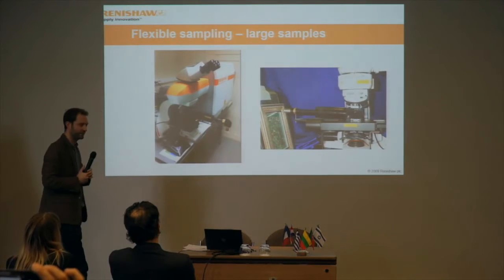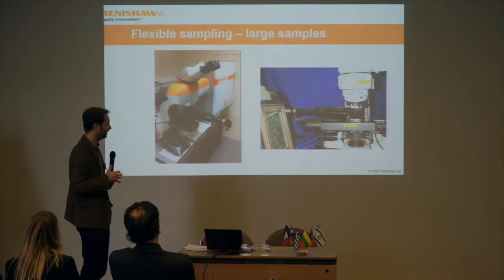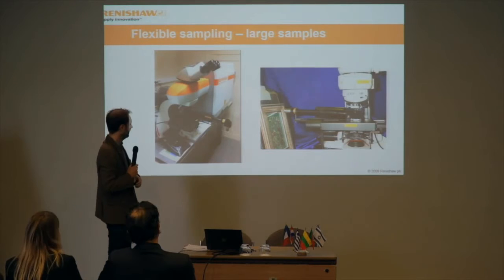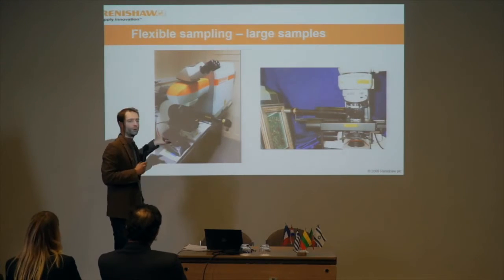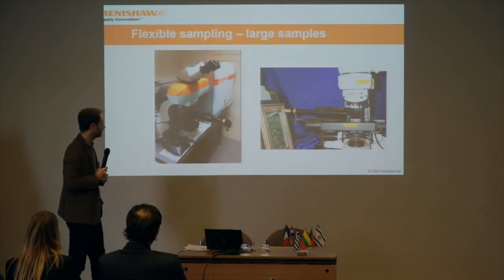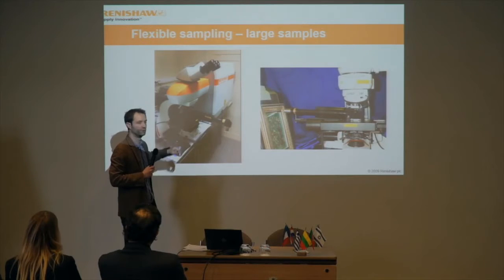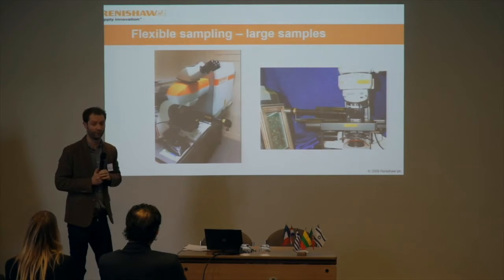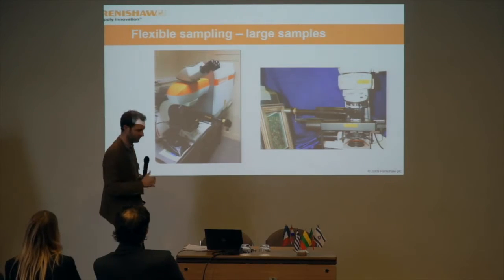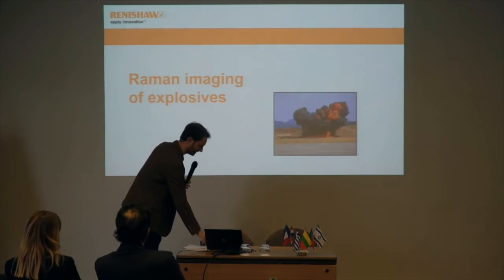Also, if your sample is very large, like the A4 sample, you can use what we call a flexible arm, where you can deport the measurement while keeping the precise movement of the stage, because this arm is attached to the stage. So it's quite nice. You cannot, however, do mapping on A4 with such apparatus. So I'll go through a couple of examples.